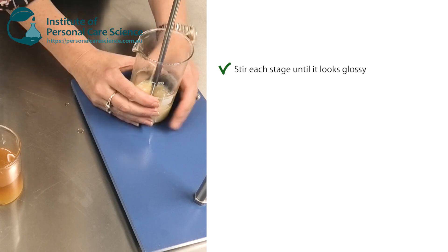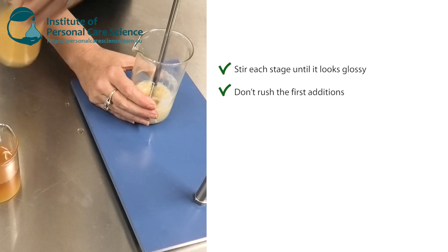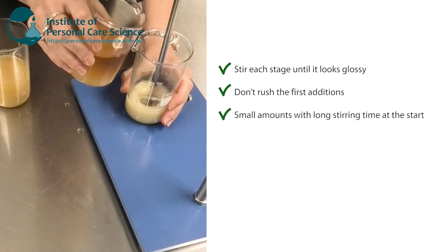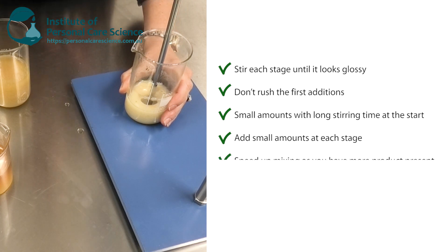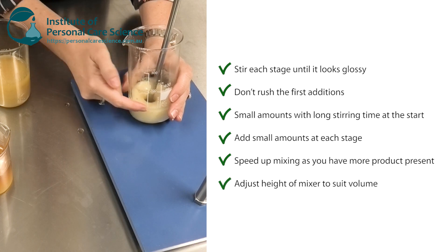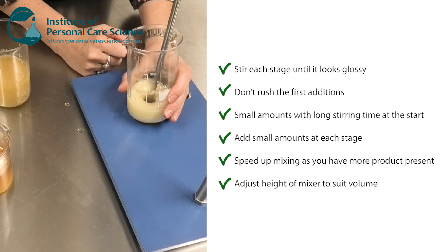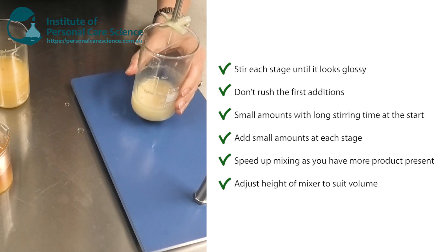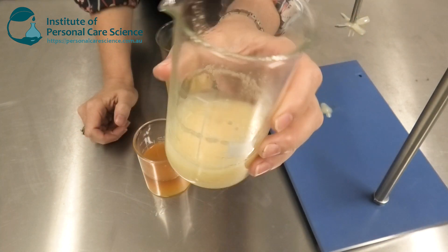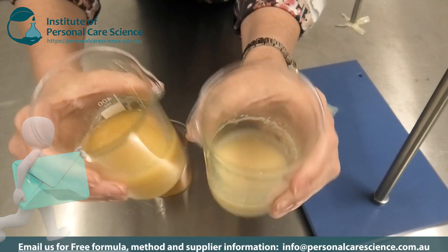Now it's starting to look glossy — and already you can hopefully see it's a very different color to the way the failed one turned out. I'm on the right track and this is how it should have looked from the start. So I'm going to add just a little bit of oil now and let it have time. I'm also going to increase the stirring speed of my propeller, making sure I get a nice glossy gel formation in this beaker before I add any more oil. Look how much more viscous it is already, and I've hardly added any oil — it's also looking really glossy compared to the matte-looking failed product.